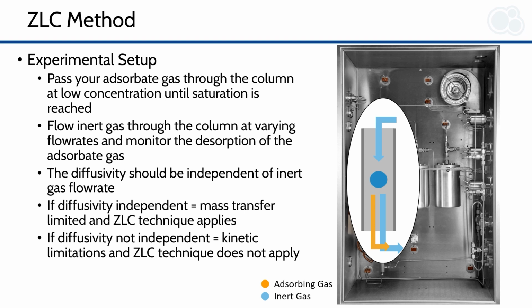The diffusivity should be independent of your inert gas flow rate, and if the diffusivity is independent of the flow rate, it means that you're mass transfer limited and the ZLC technique applies. If diffusivity is not independent, then you likely have some sort of other dependence, such as kinetic limitations in your process, and the ZLC technique does not apply.